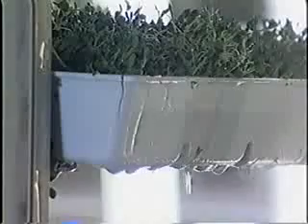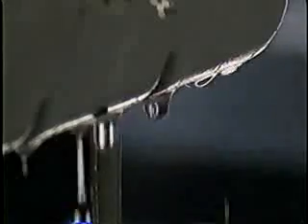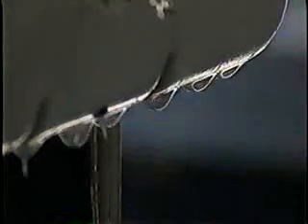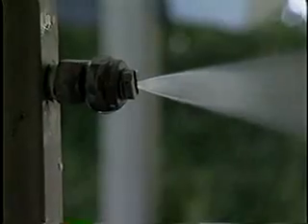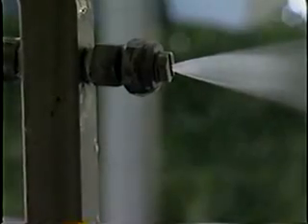If sprouts are grown in trays and there is no common collection point for water from the trays, it will be necessary to collect water from individual trays. The amount taken from each tray should be approximately the same. Collecting the entire sample from one tray would not be representative of the whole lot. Samples should be collected at the beginning of the irrigation cycle, especially when irrigation uses a large volume of water or lasts a relatively long time.